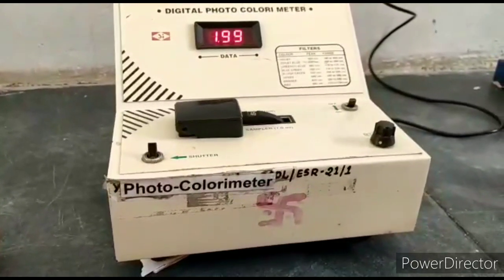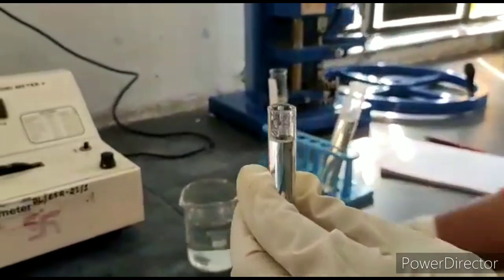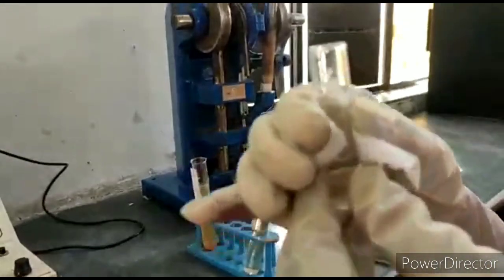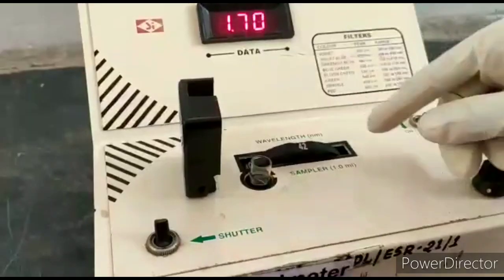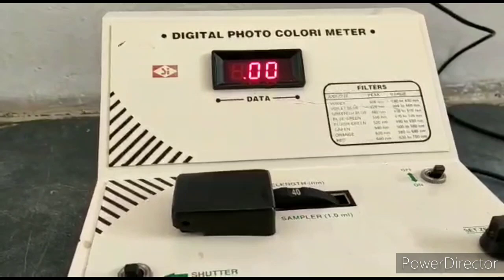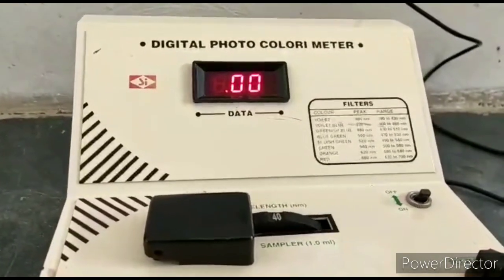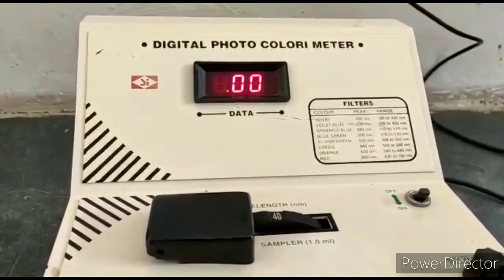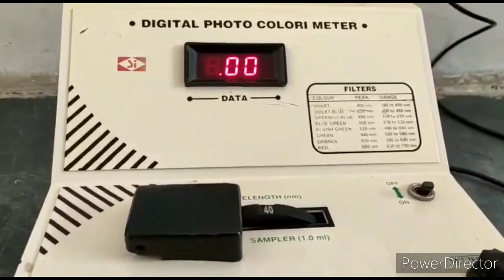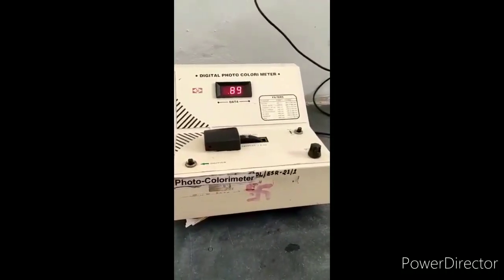Now we will take a blank reading using distilled water. Take 1 ml of purified water, keep it in the sample slot, and adjust to set the blank reading. Follow the same procedure for each filter using purified water, then follow the same procedure for sample solution and standard solution.